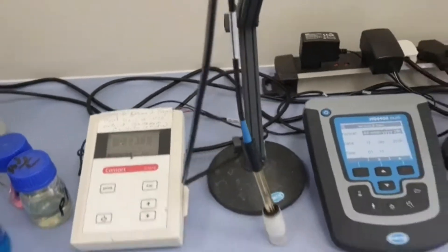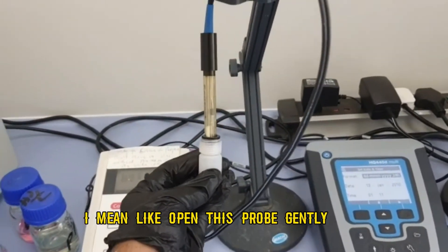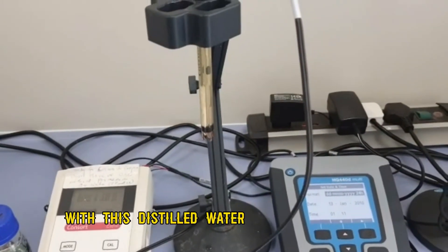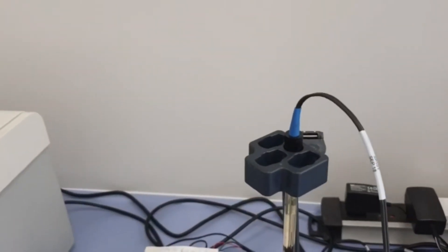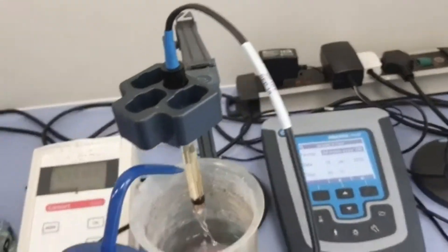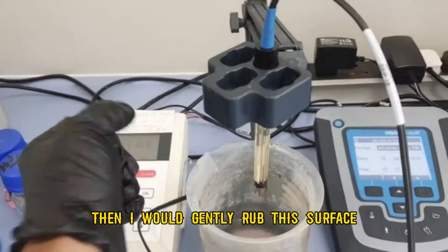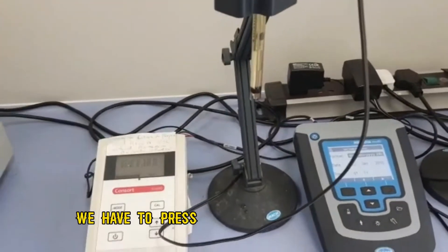First of all we have to gently open the probe. I have opened the probe. Now I will clean this probe with distilled water, and then gently rub the surface with the help of a tissue.